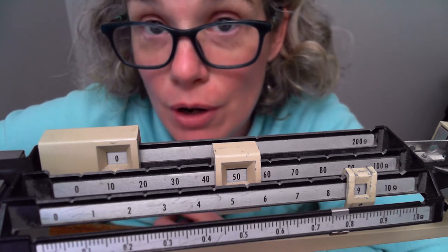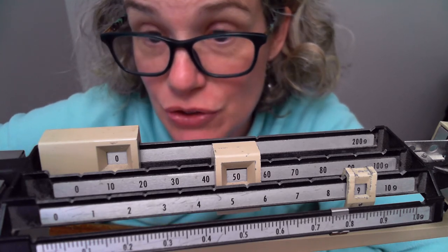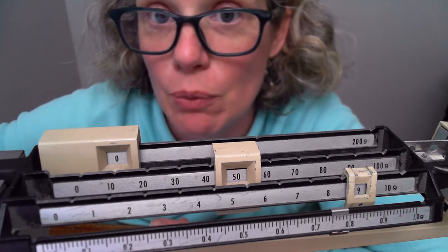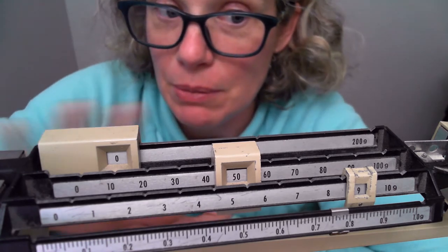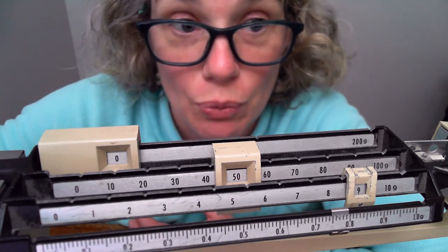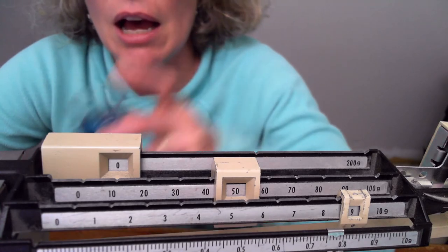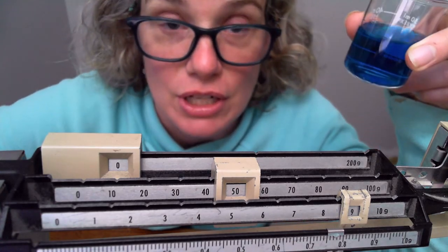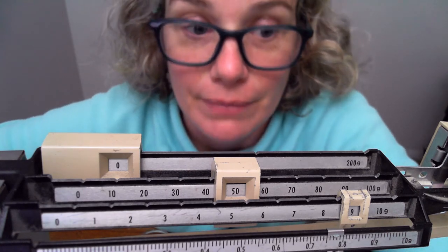This process is called finding the mass of an object by subtraction. It's useful not just for water but for salt or anything you don't want on a contaminated surface. In a classroom with limited balances, having your substance in a beaker means it's transportable — you weigh it and walk away so someone else can use the balance. Have a good day.